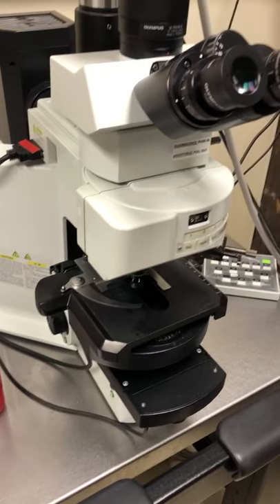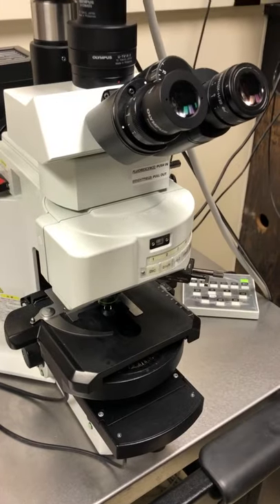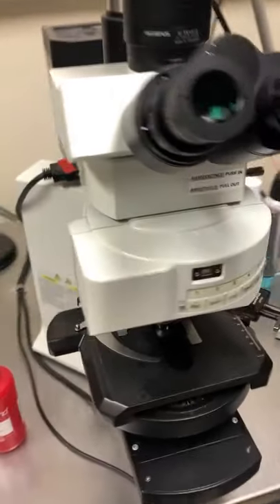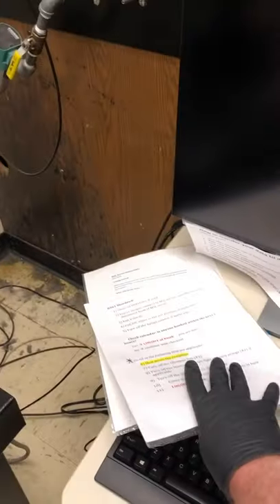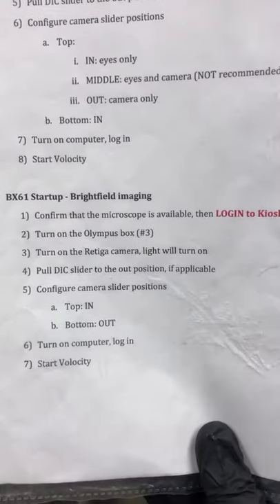Okay, so I've disinfected the microscope. Next I need to turn it on. This video is a refresher for how to use the microscope to take bright field images. I'm going to grab the instructions and look at the section for bright field imaging.